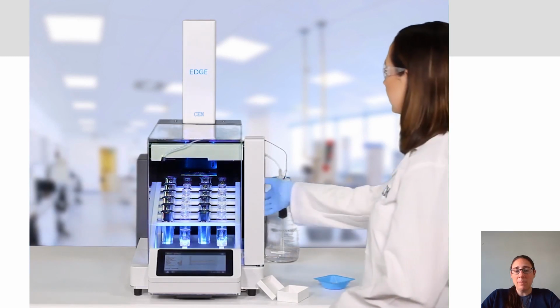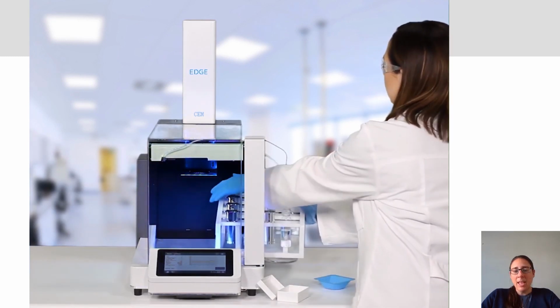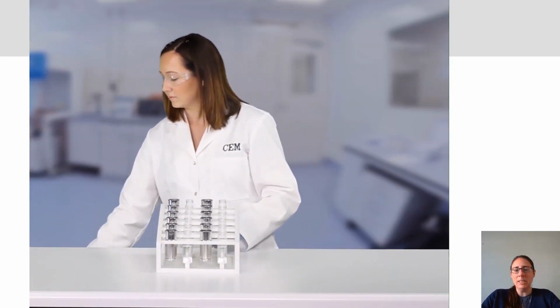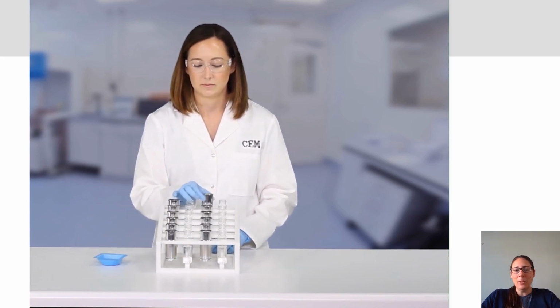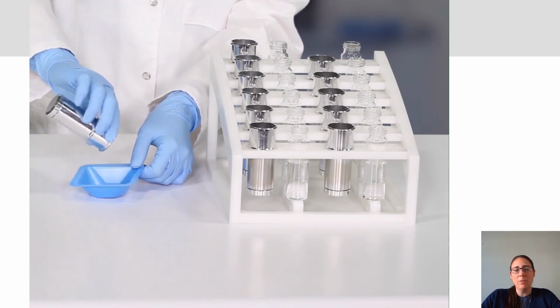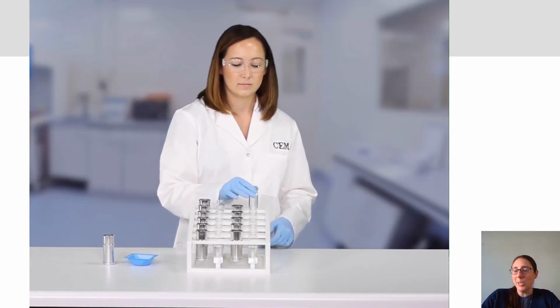You're going to see Brittany come back over here, grab that rack. And this is just a feel-good moment where you can take that sample that was just wet and look at it, and it's completely dry. So, you know, we've recovered everything, right? We're not leaving anything behind. Of course, we need to look at our recoveries, but just feel good that your sample itself is no longer wet. And we've got a filtered sample ready to go for analysis.